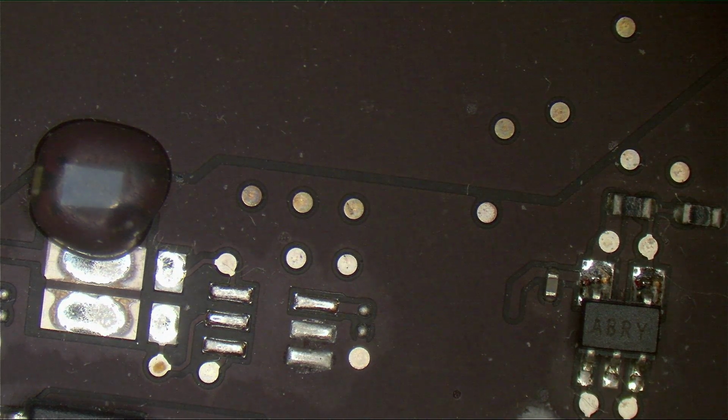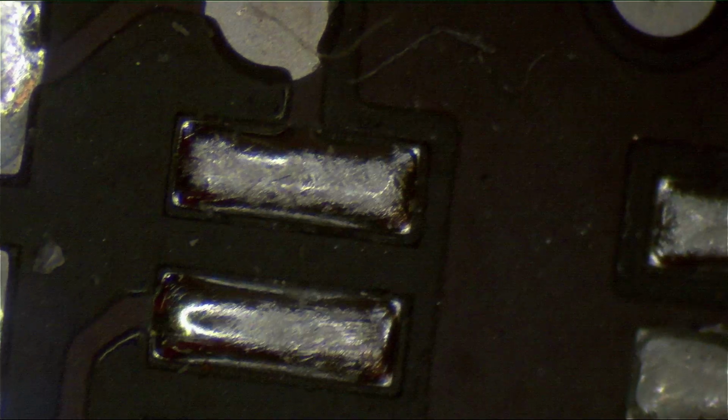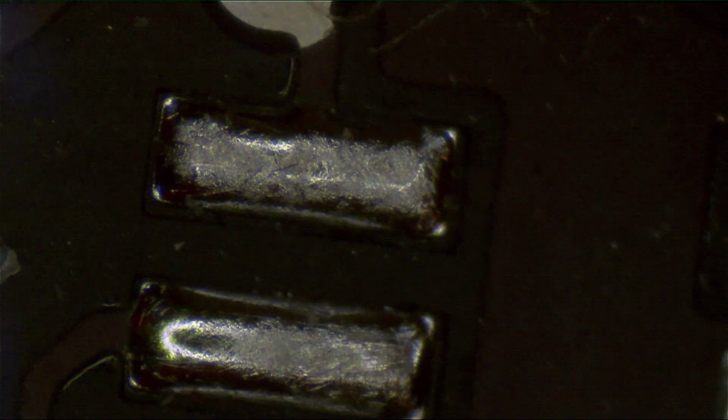What I notice with people who do not have an adjustable light is they use the zoom to adjust the light. So let's say they would ideally be working at 10x. But 10x is too bright for them because they don't have an adjustable light. What they'll do is they'll move it up to 20 or 30x just to make it darker, but that's not ideal for their workflow. So they're working at a zoom that is not ideal for their workflow just because the light is not adjustable.